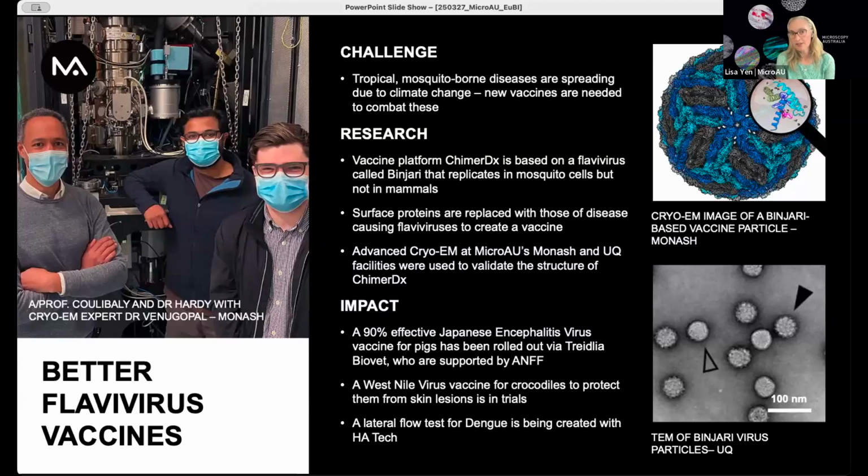Again, I'm not going to go through each of these case studies, but just perhaps wanted to use them to illustrate how that challenge and research and impact structure is something that we've found really effective. It does give us the opportunity to showcase images or micrographs, or in this case, a reconstruction where you've got the cryo-EM that was really critical to them understanding the vaccines that are relevant for a range of different flaviviruses like dengue or Zika or West Nile disease.